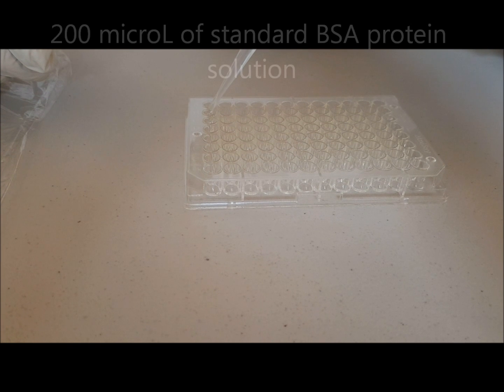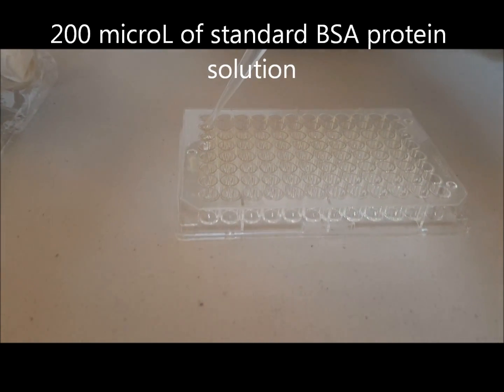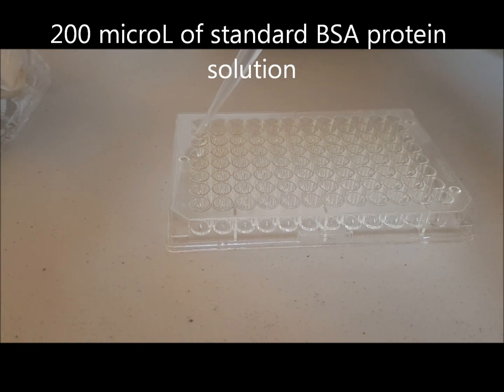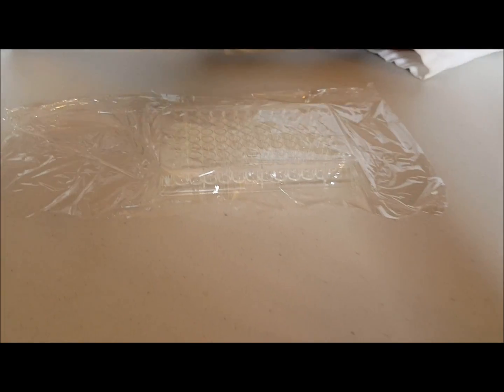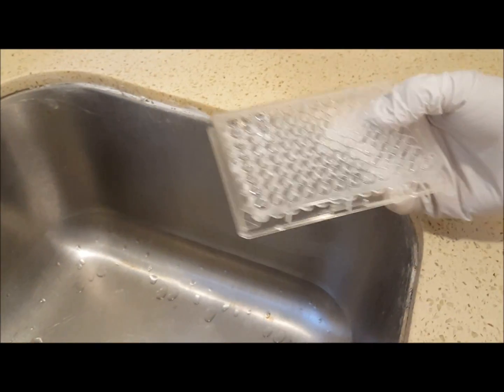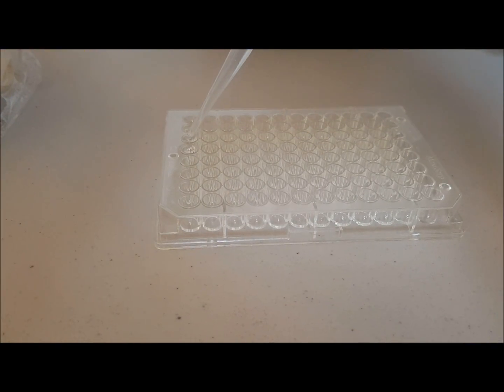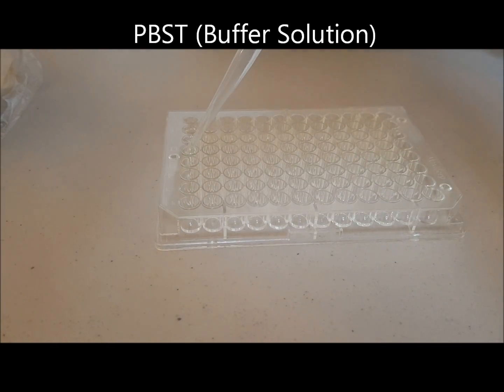As the next step, 200 microliters of blocking standard BSA protein is added to the wells. It's incubated for one hour at room temperature. The excess is then removed. The buffer is once again used to wash the wells.